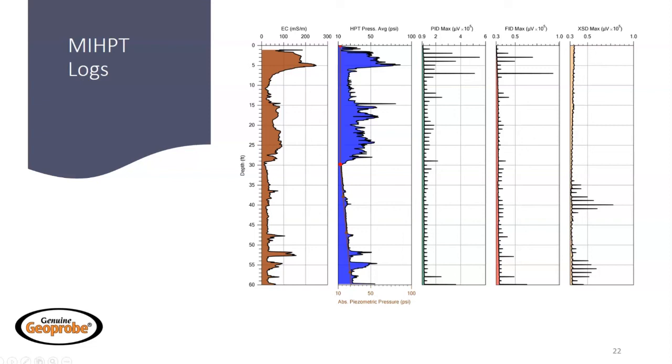While MIP cannot tell specific compounds or exact concentrations, quite a bit of information about the contaminants can be discerned from the logs using your knowledge of the detectors.